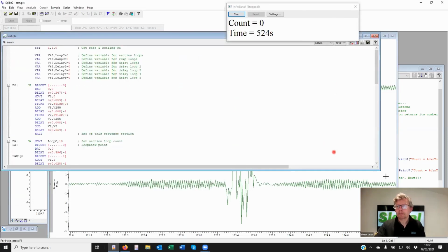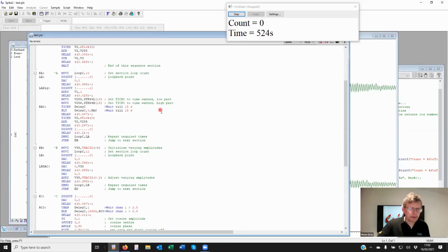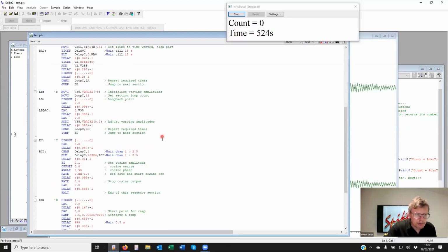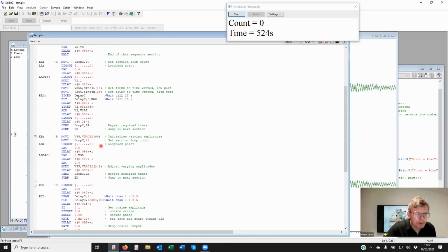Okay. This is written out all of the code, which ultimately would end up inside the 1401. Now, if I can find the section which had the digital outputs, that would have been A. Okay, digital delay. This has been somewhat improved compared to before.